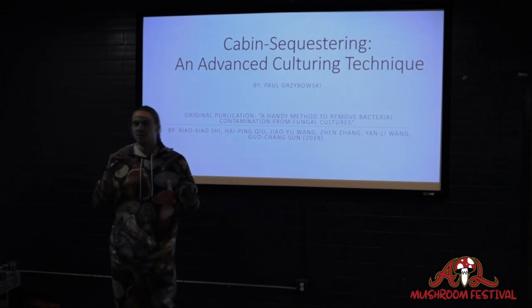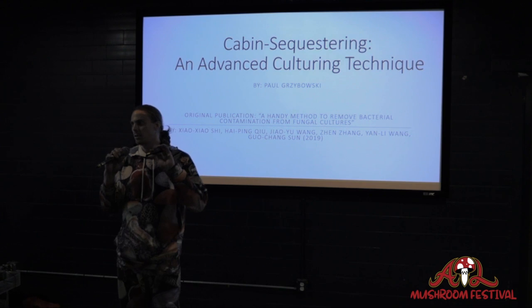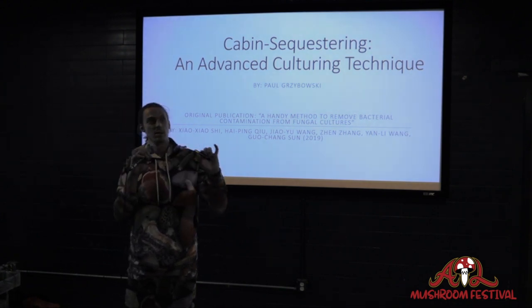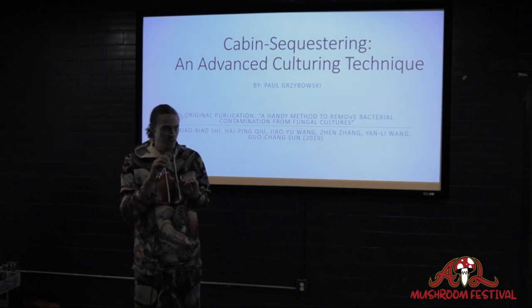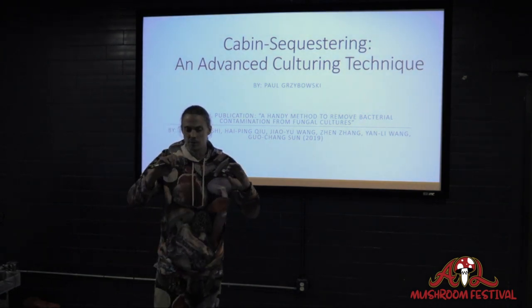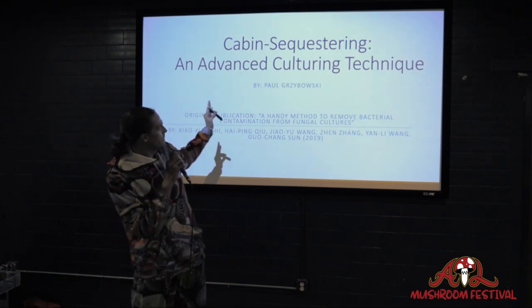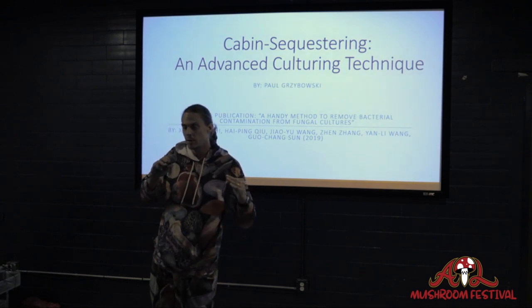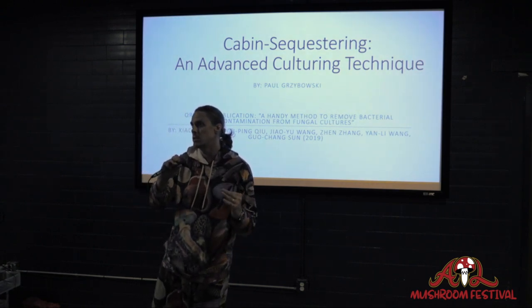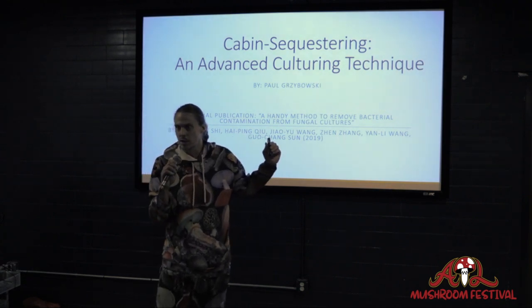So I'm gonna be totally honest. This talk is going to get into some serious weeds of science. This talk is about using a very specific culturing technique in order to improve your ability to cultivate. There are a lot of different ways you can cultivate mushrooms, but the cabin sequestering technique is the biggest innovation in culturing that has happened in almost the past 100 years. And this was published in December of 2019.